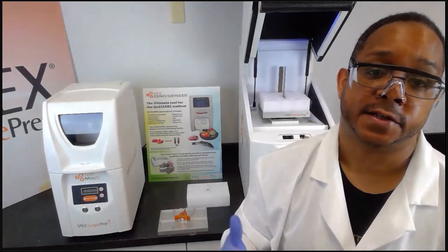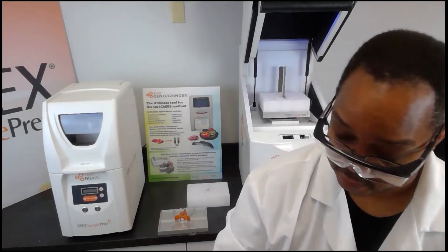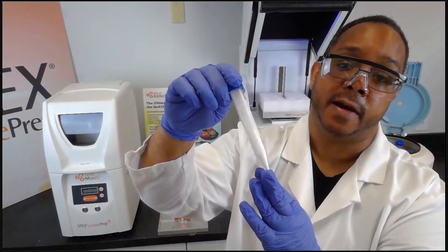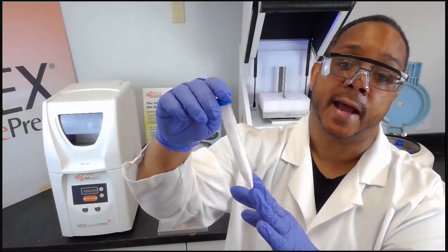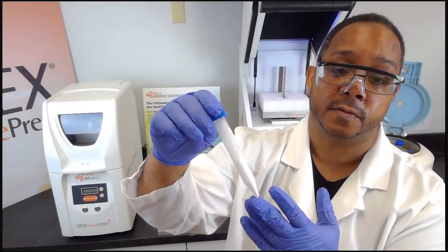Afterwards we want to include what we call a cleanup step. The cleanup step involves adding a salt matrix that will remove water and undesired co-extracts. The salt matrix we're going to add is six grams of magnesium sulfate and 1.5 grams of sodium acetate. Most kits may also include a small amount of activated carbon, which is used to remove pigments such as chlorophyll that may interfere with the analysis.